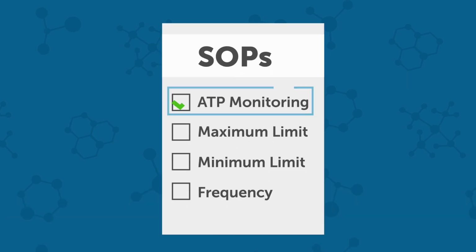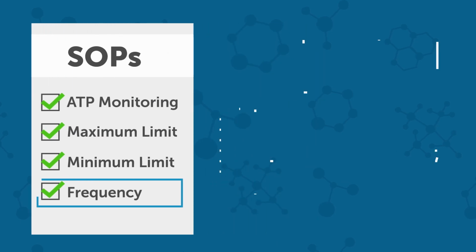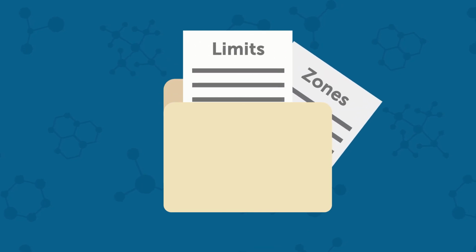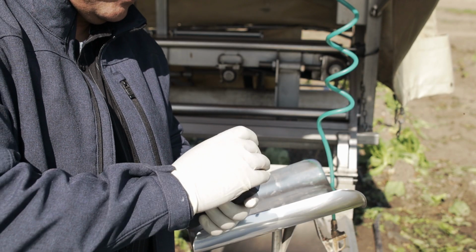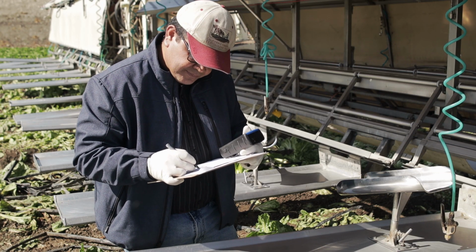If your food safety practices will include ATP as a verification of equipment cleaning and sanitation events, food safety professionals should start by mapping their entire facility or harvest machinery into multiple zones for measurement purposes, determine the normal ATP results in the zones, establish limits and a testing frequency suitable for their specific practices. Directions or procedures for utilizing ATP swabs and monitoring equipment may vary among manufacturers. However, in general terms, they are as follows.